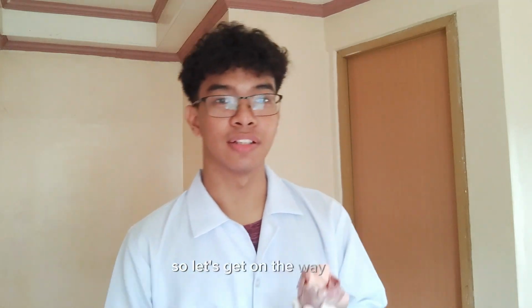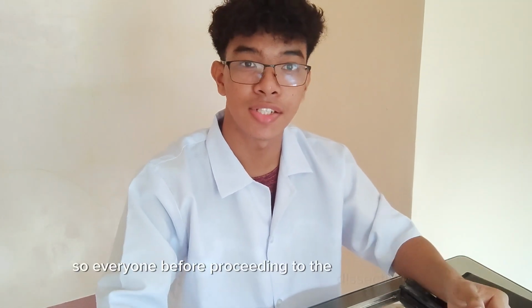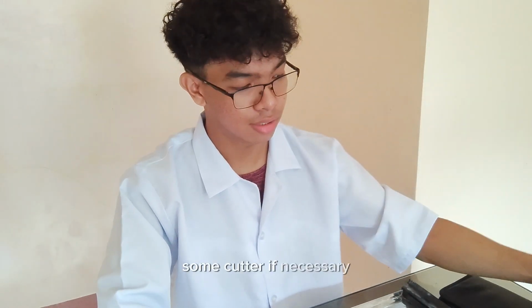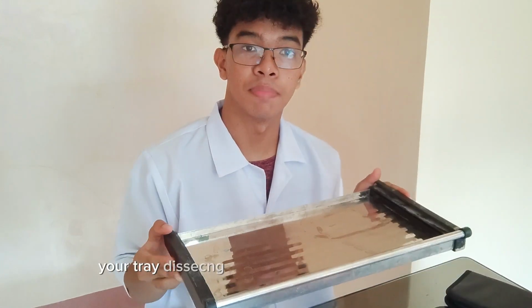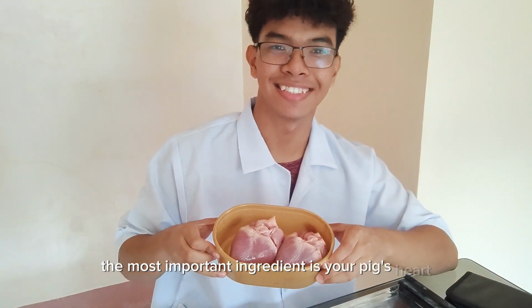So let's get on to it. Grab your kits and let's proceed to the dissection. So everyone, before proceeding to dissection, join me. Grab your gloves, some cutter if necessary, a dissecting kit, your tray, dissecting pan, and especially the most important ingredient, your pig's heart. Let's go.